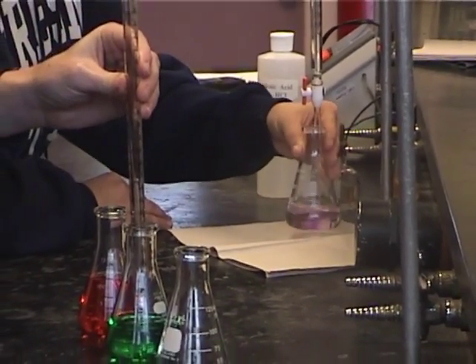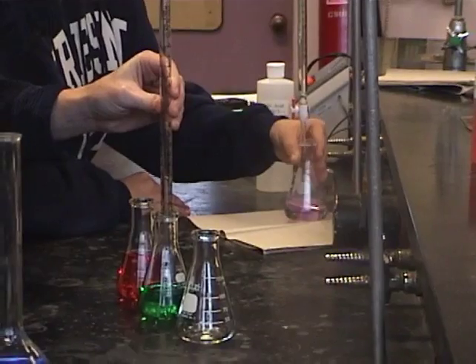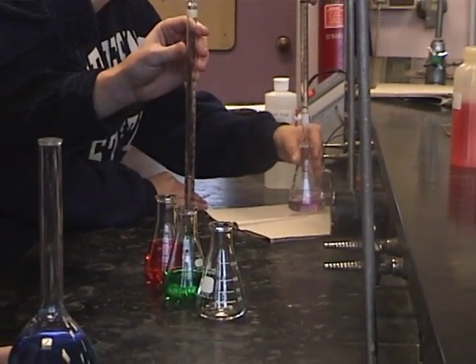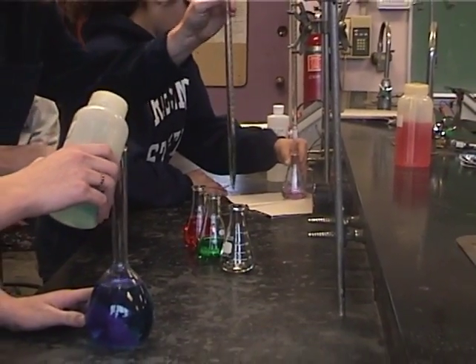These techniques involve the careful measurement of sample and reagent volumes. The most common types of glassware used for volumetric analysis are the burette, the pipette, and the volumetric flask.